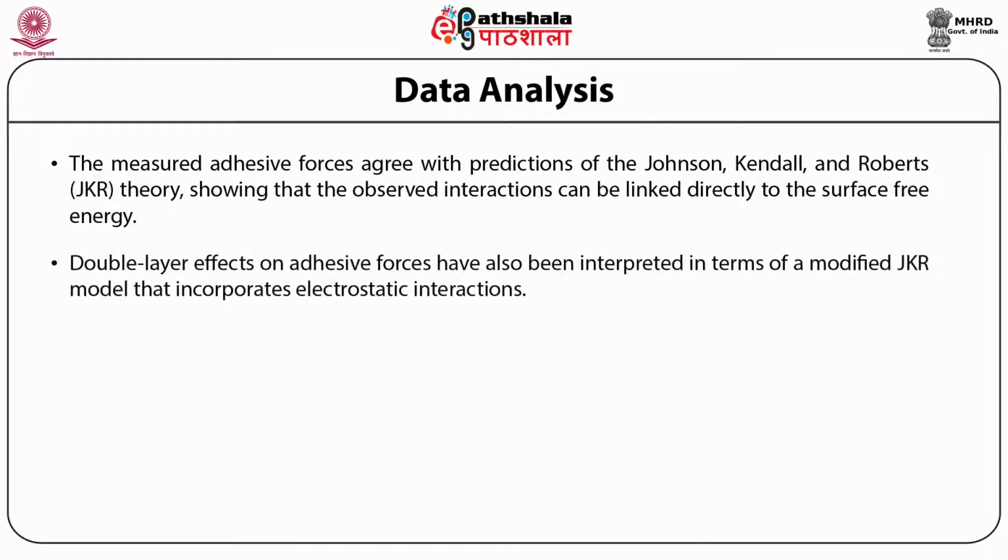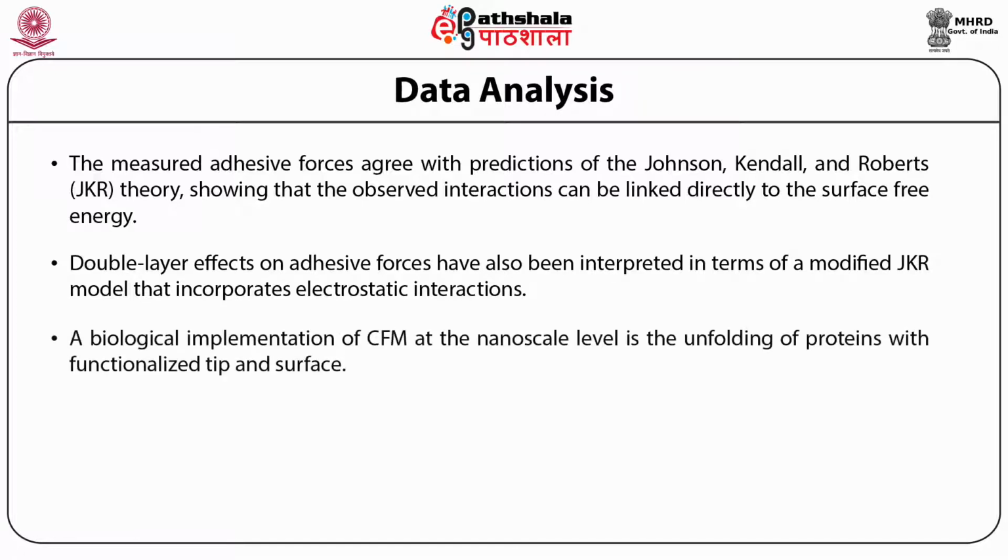Double layer effects on the adhesive forces have also been interpreted in terms of a modified JKR model that incorporates electrostatic interactions. A biological implementation of CFM at the nanoscale level is the unfolding of proteins with functionalized tips and surfaces.